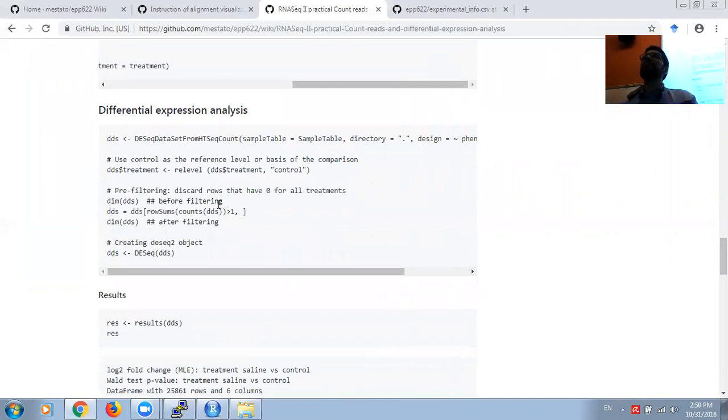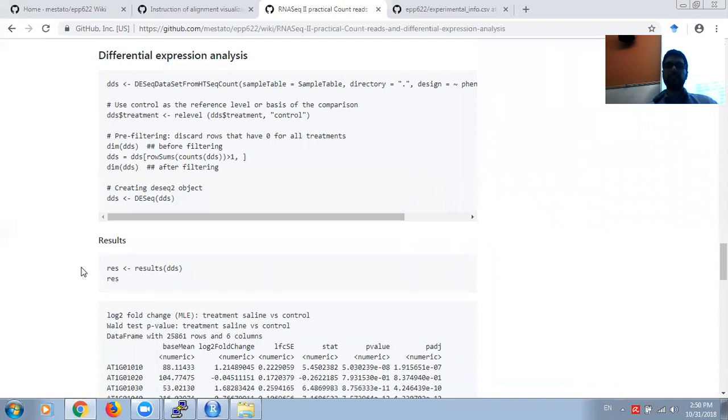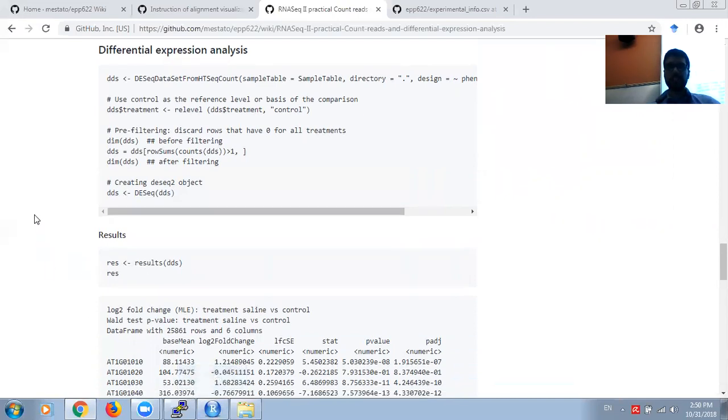I think you have to choose the directory where you put your HTSeq count files. Just search where you located them after you got them from ACF. If you can relocate them specifically onto the desktop, you can go ahead with the rest of the analysis.